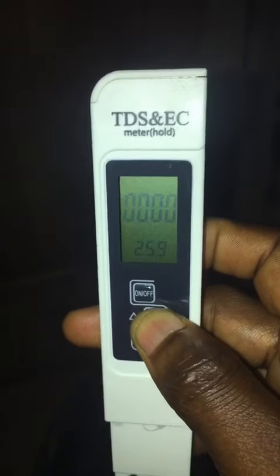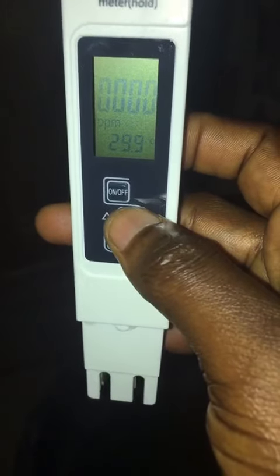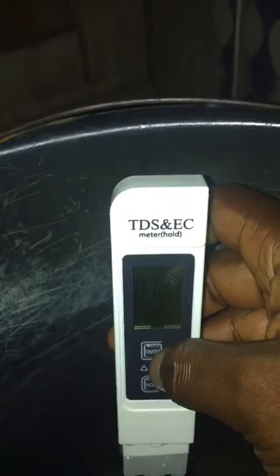If you press mode again, it changes to TDS and the temperature changes to degrees centigrade. Right now it is in TDS with temperature in degrees centigrade. To take a measurement, put the meter inside the water.